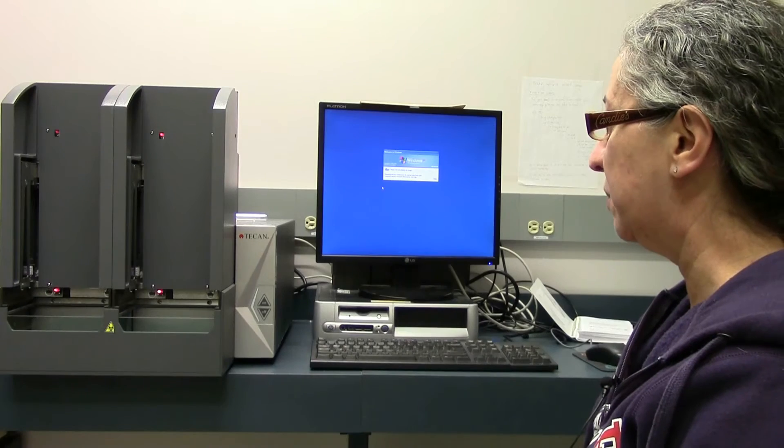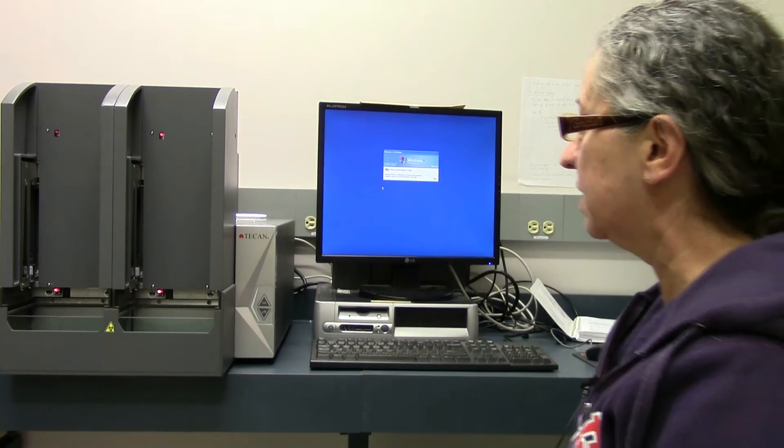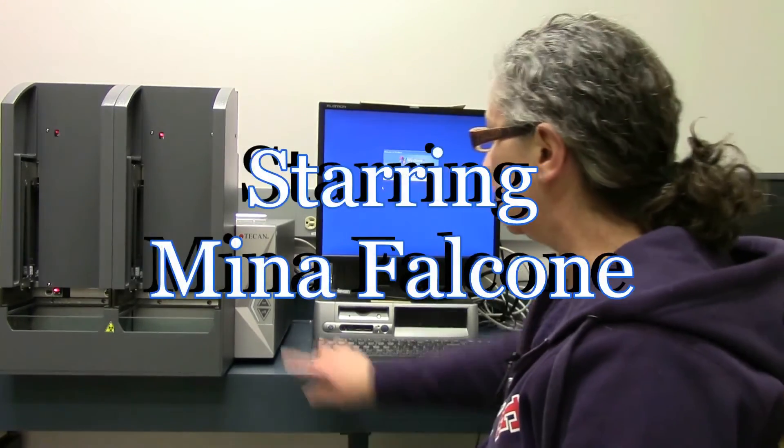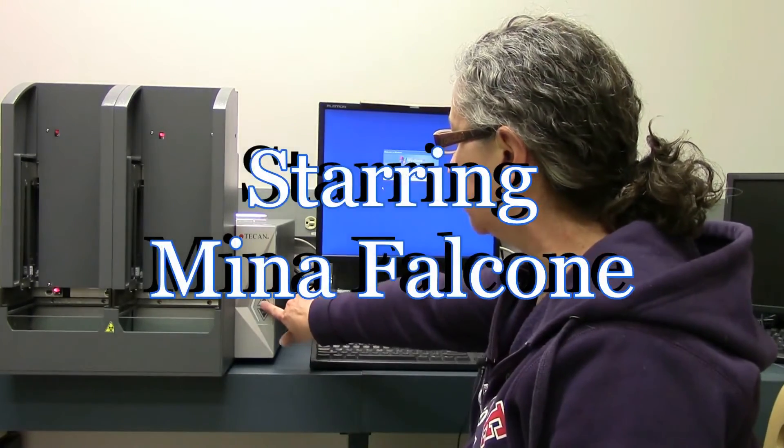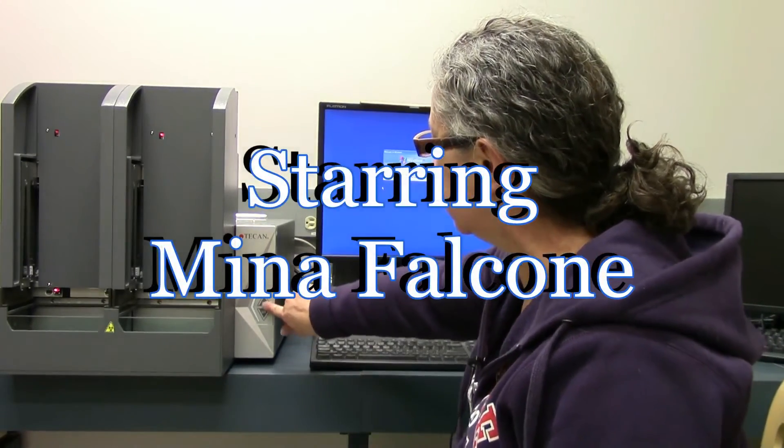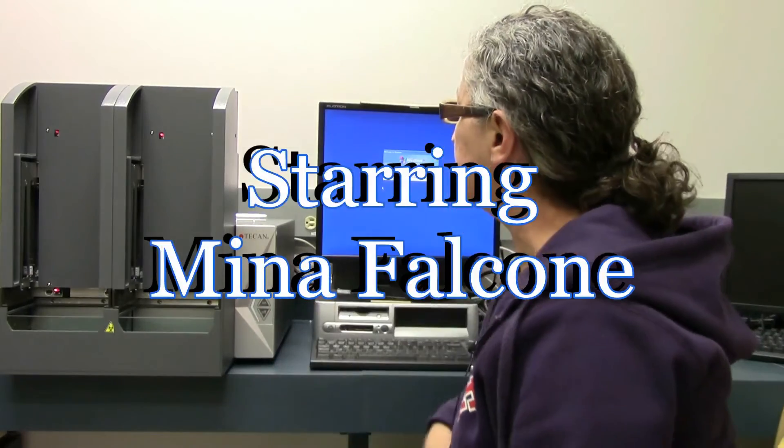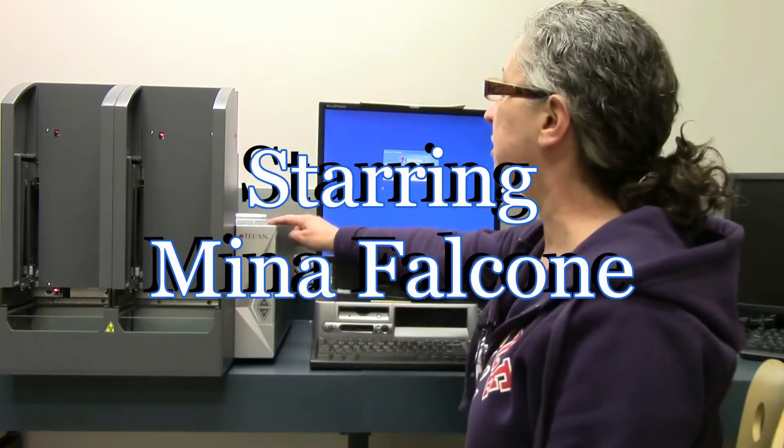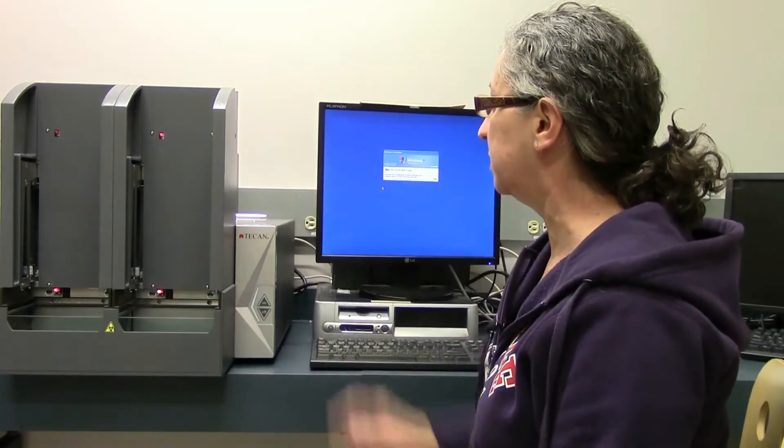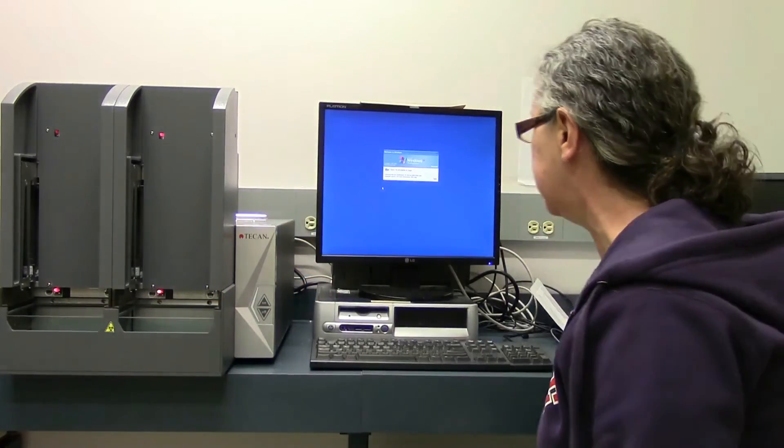This is the Tecan M1000. First, to turn it on, the button is here. Just press this button and then a little green light will light up at the top to tell you that it's turned on.